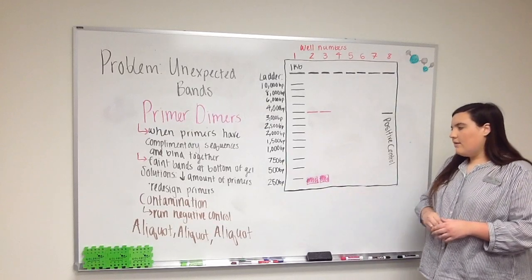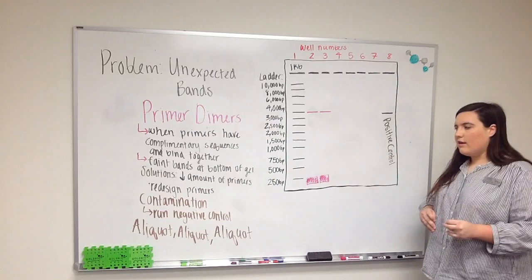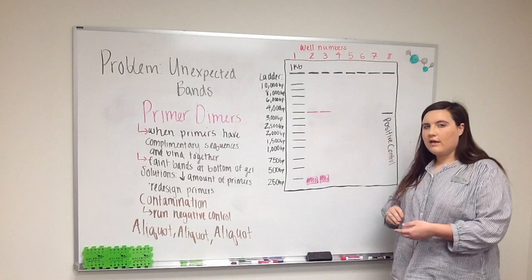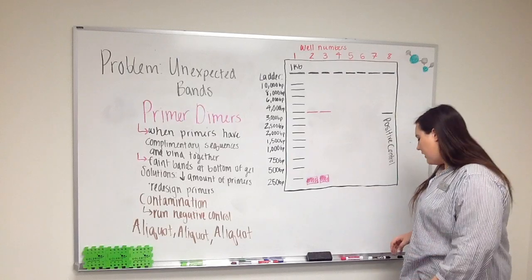What these are is when the primers have complementary sequences to each other and they bind to each other. Since they're such short fragments, they make a small faint band on the very bottom of your gel. How to minimize this is to reduce the amount of primers you're using, and also you can redesign your primers so that they're not complementary to each other and they're just complementary to the template strand that you're trying to amplify.